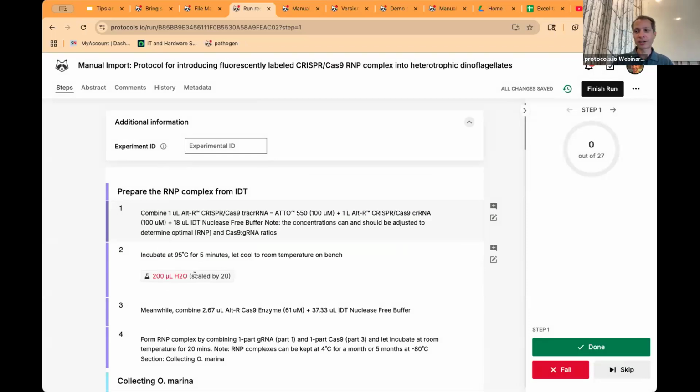It will let you know that you have modified it, so you'll see that in the record after you've run it. But this does not work on tables right now, unfortunately. So it would need to be in the component amount form for that. So great question.